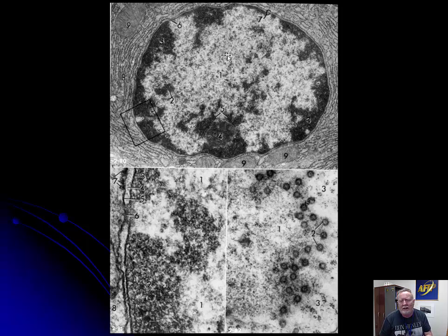Now, a lot of people like to spend a lot of time saying the nucleus is small and has large amounts of euchromatin and small amounts of heterochromatin. I'm like, oh, you told me nothing. Okay, everybody knows euchromatin, heterochromatin. I never can assign points for that if I'm grading a description. People like to write it. It really doesn't make all that much difference. I can tell very little about a cell from the nucleus itself. I can make a very general interpretation here if everything's preserved well.